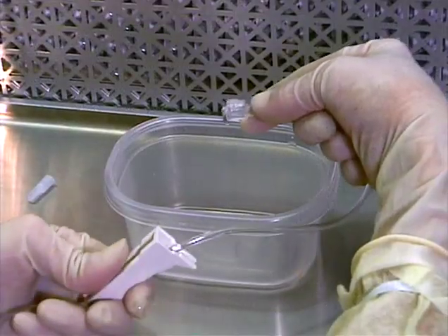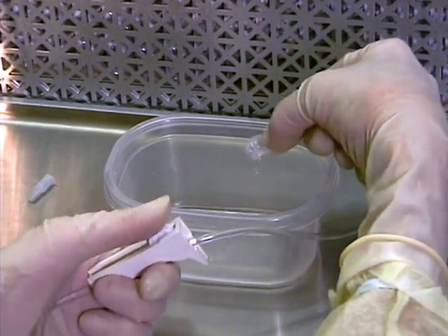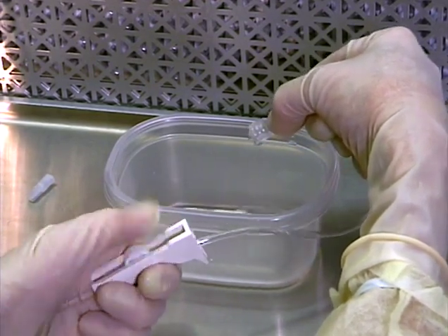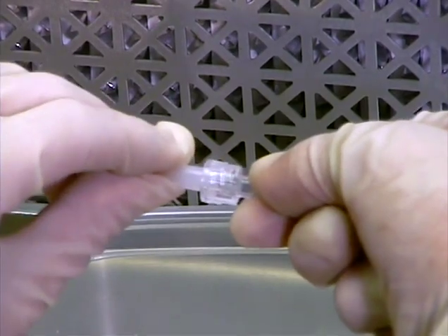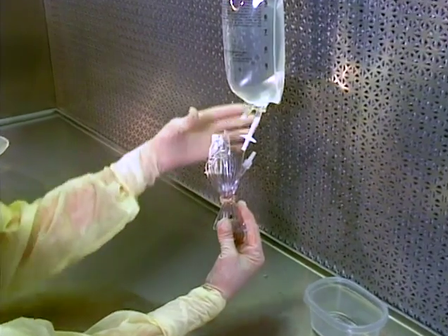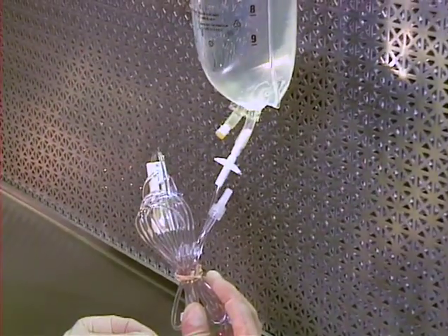Aseptically place the delivery end in first air over a specimen cup or other receptacle and remove the cover, setting it aside in first air. Open the flow regulator and any slide clamps and prime the tubing. Close the flow regulator and slide clamps and be sure they are secure. Recap the distal end of the tubing, carefully folding the tubing and secure it. Check that the tubing will not leak by pressing slightly on the bag to generate internal pressure while observing the closure for any leakage. Complete compounding as usual.